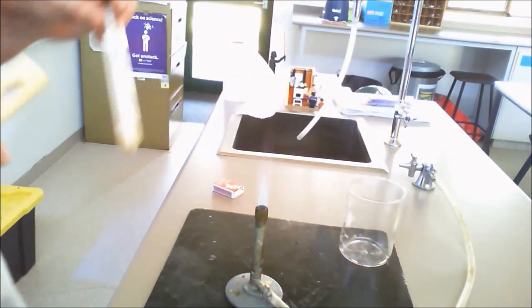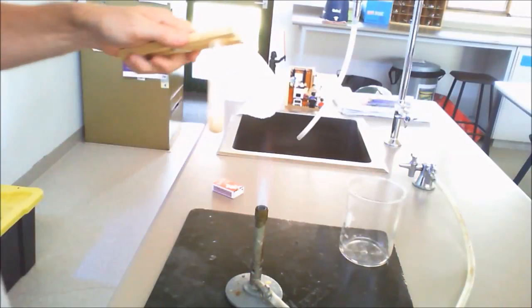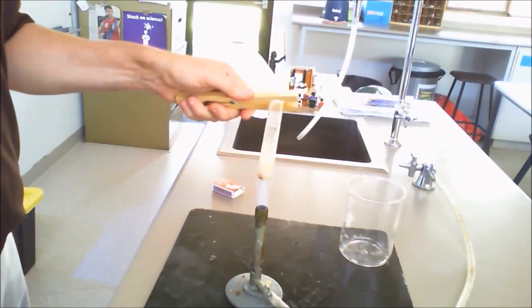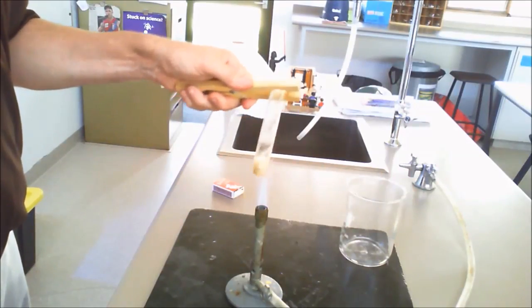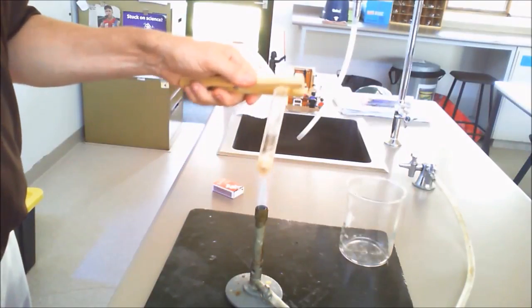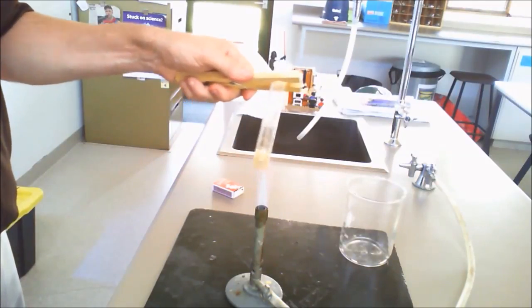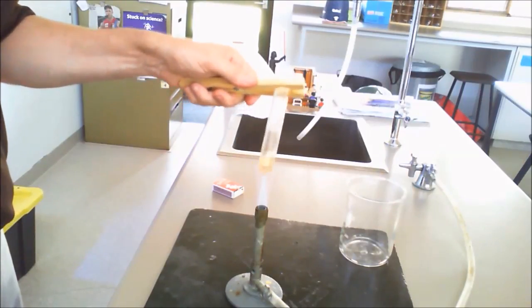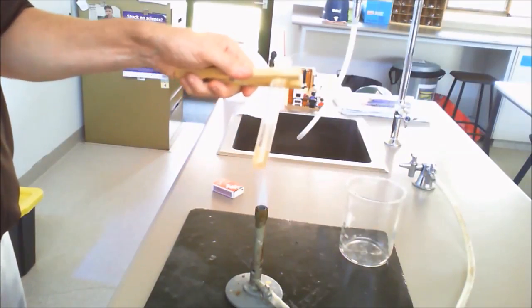Now, hopefully you have written down in your write-up the characteristics of a solid, and now we'll go through and apply heat and melt this. Now, you'll notice a couple of things. Number one is that I'm moving the test tube through the flame rather than just having the flame hit the test tube at one particular point. That just helps to protect the test tube because obviously every time you put flame on it, a little bit of the test tube wears away, and you'll notice that I'm pointing the open neck of the test tube away from me, so if it does boil over, it's not going to end up on top of me.